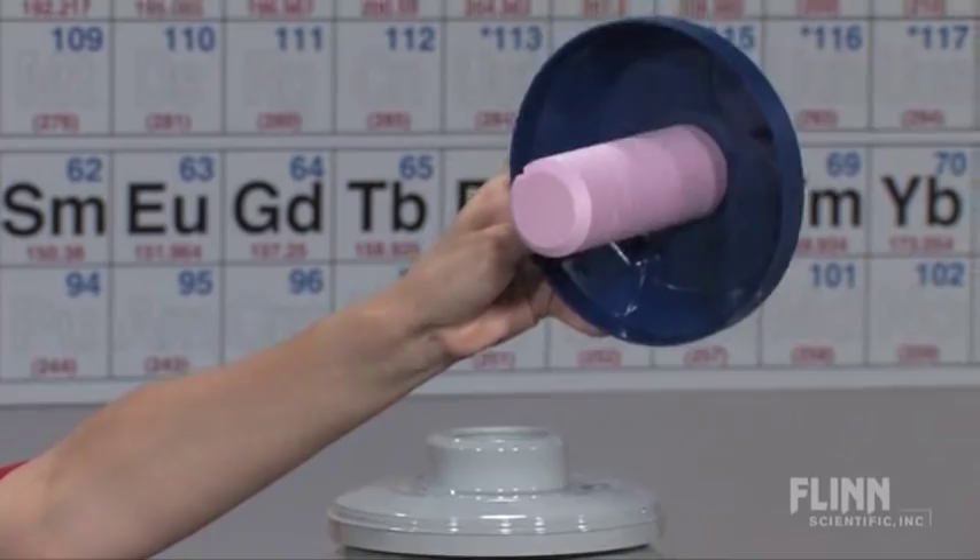Count on Flinn Scientific to equip your lab with the right tools for all of your demonstrations.